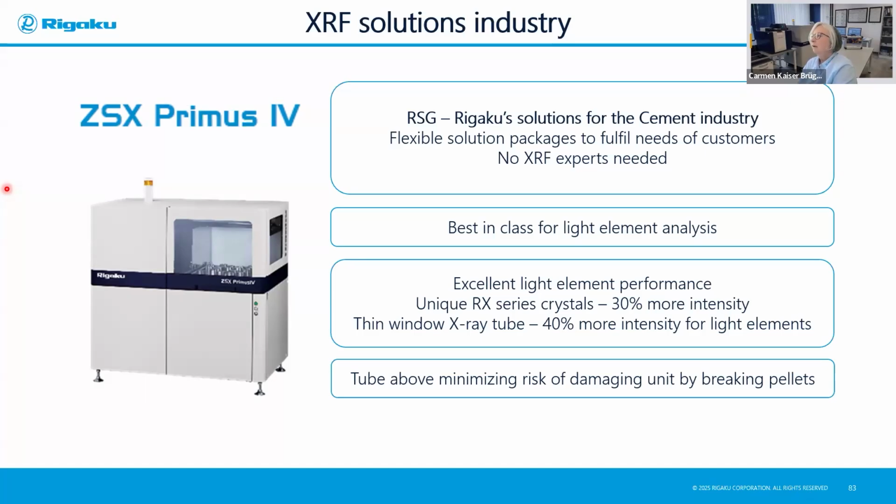But of course, if we prepare this kind of sample with a fusion method, our fusion flux contains boron. But if we apply the fusion to our standards and our samples, realistically, it's always going to be the same amount of boron. So yes, we can also use this kind of method, but it's always important with fusion that we have the possibility of losing boron.